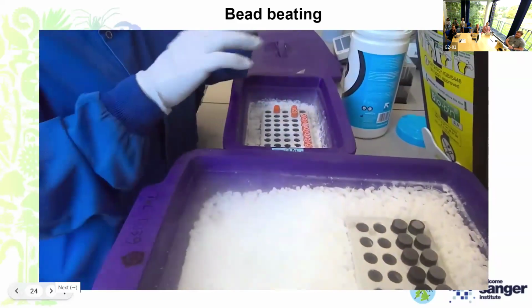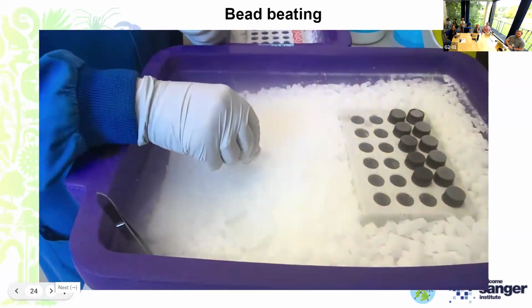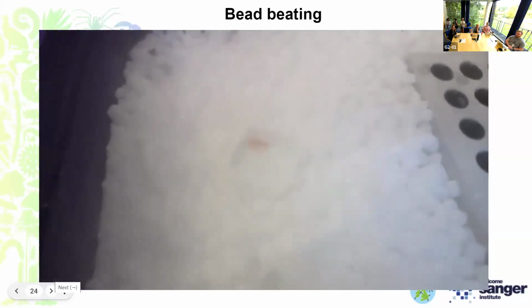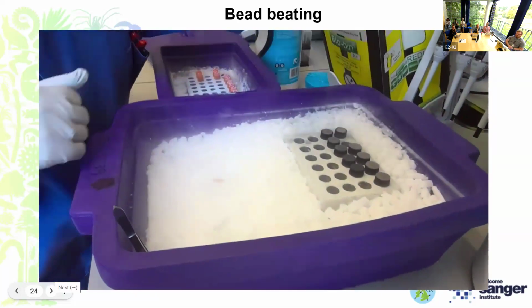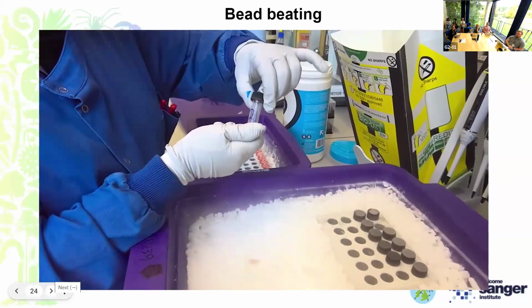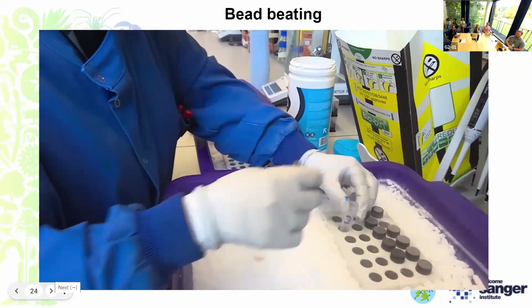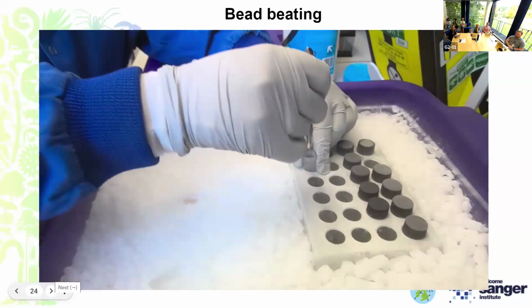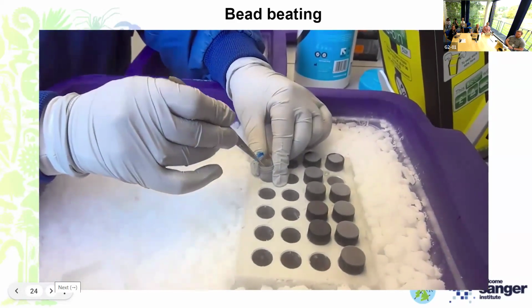So we use special polycarbonate vials that you see here. We add 4mm zirconium grinding satellite beads to these corals, so they get a very specialized type. The sample on the weighing boat at the moment is an Acropora species. I pre-chill the tubes before I do this, because I want both the beads and the tubes to be nice and cold. Then I add the sample, which has already been weighed and prepped, into the polycarbonate vial.